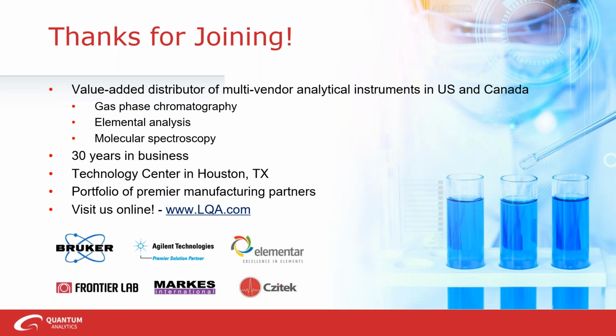Sure. For the first question we have, for QC confirmation of polymorph, could you compare samples to a reference spectrum, or is it better to run the standard each time with the sample? Good question. I should give a caveat to this. Every business, every company within the pharmaceutical space has their own quality standards, so take what I say with a grain of salt.